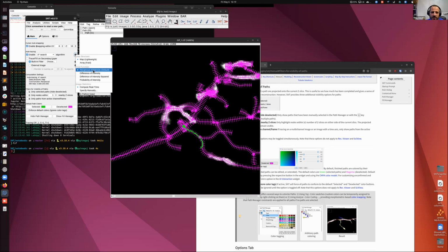And then you have different cost functions here, and what these are are penalties. These are penalties that will instruct the algorithm to stay on course between the starting point and the end point, very, very briefly. And you have some explanations here. So it tells you, for instance, if your image has a certain property, use histogram, then use this one. If it doesn't have, use this one. If you don't know which one to use, just leave it as default. But there are tweaks here that you can use, and this is actually quite useful because it allows you to trace, in bright field images that typically have more background, and you can ensure that the curvature is going to be more accurate.